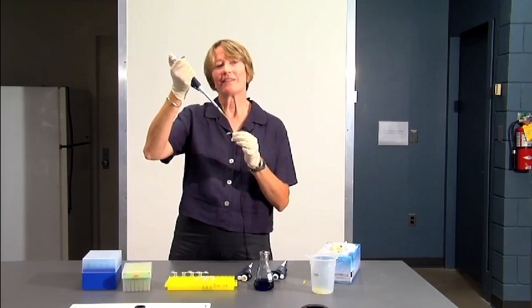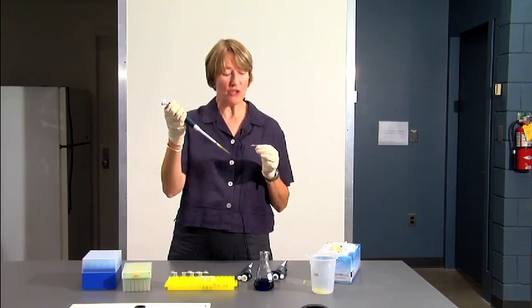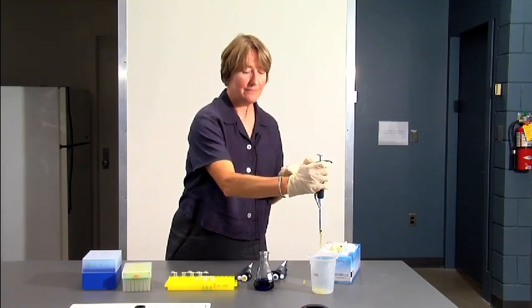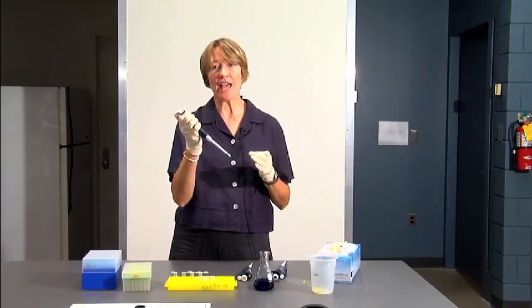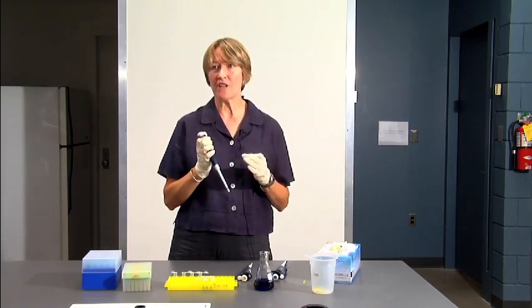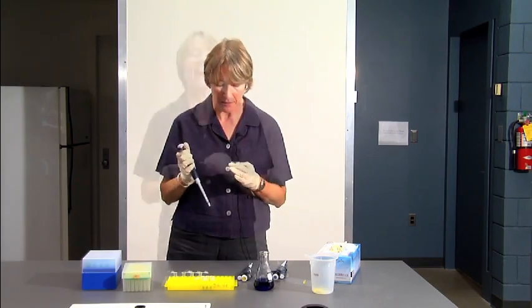When you've finished adding your solution to the tube, you will eject the tip into the waste bucket by pressing down on the tip ejector. This way, you never actually have to touch the tip from the time that you take it out of the tip box until the time that you have finished your pipetting. And that way, if you're working with toxic chemicals or bacteriologicals, you're not going to contaminate anything.